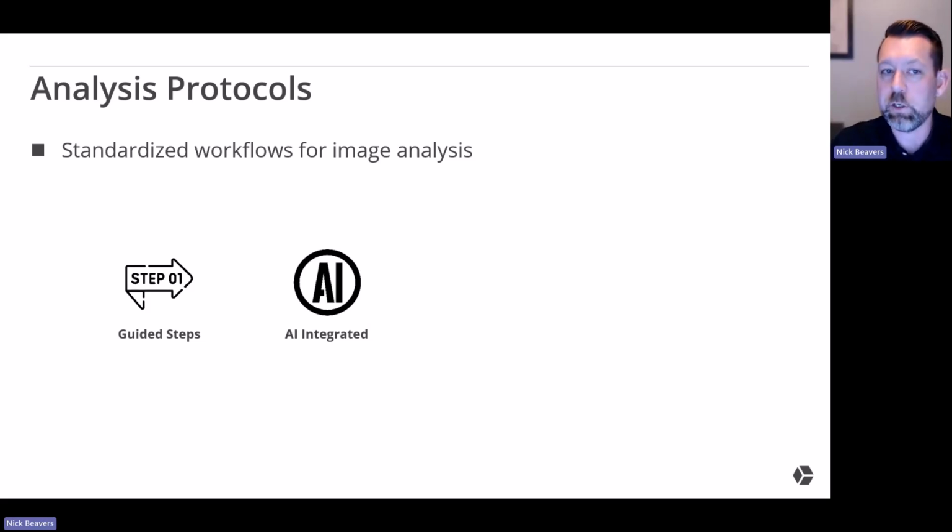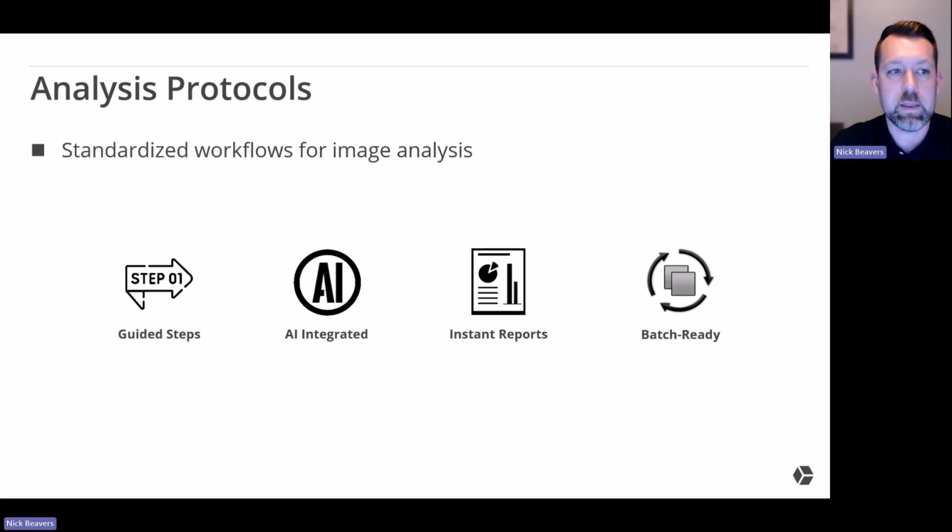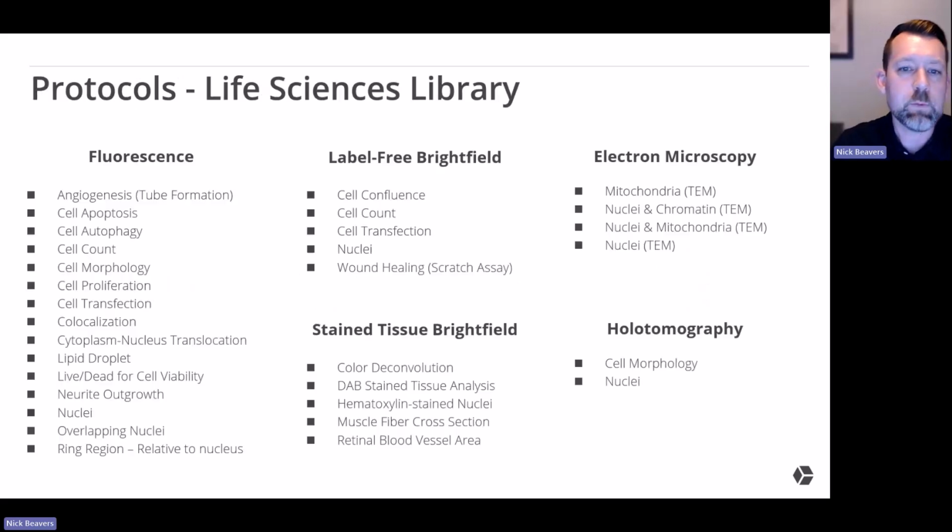Now we can actually just include that into our workflow. We can establish some instant reports that'll be created right at the end of the protocol. And then of course we can batch process. So these four things are what make up the protocol. Again, there are other tools out there that are kind of similar. We've seen others out there that do a few of these things, or all of these things. Really just depends on what you're working with. In terms of freeware, you're not going to see a lot of that in freeware software. That's usually a commercial software availability with maybe an exception or two.